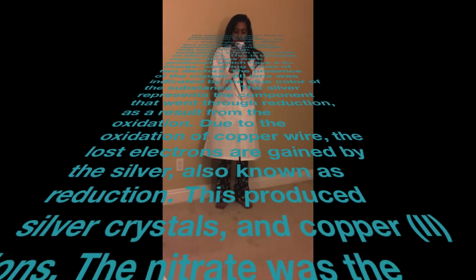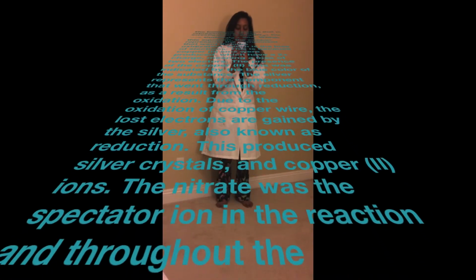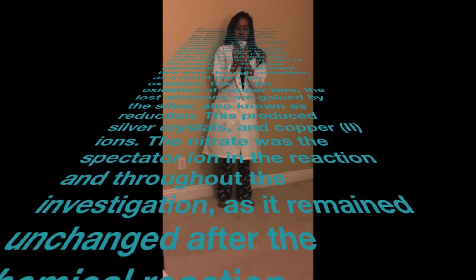The silver represents the component that went through reduction as a result of the oxidation. Due to the oxidation of the copper wire, the lost electrons are gained by the silver, also known as reduction. This produces silver crystals and copper 2 ions. The nitrate was a spectator ion in the reaction and throughout the investigation, as it remained unchanged after the chemical reaction.